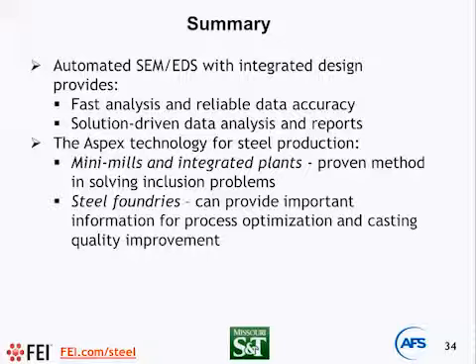When the X-ray is generated inside the matrix, because the takeoff angle is higher, typically around 45 degrees compared to the traditional 35 degrees, the X-ray will travel a shorter distance in the matrix. So the matrix effect is less. But the matrix effect is always there for EDS analysis because of the way the X-ray is generated.